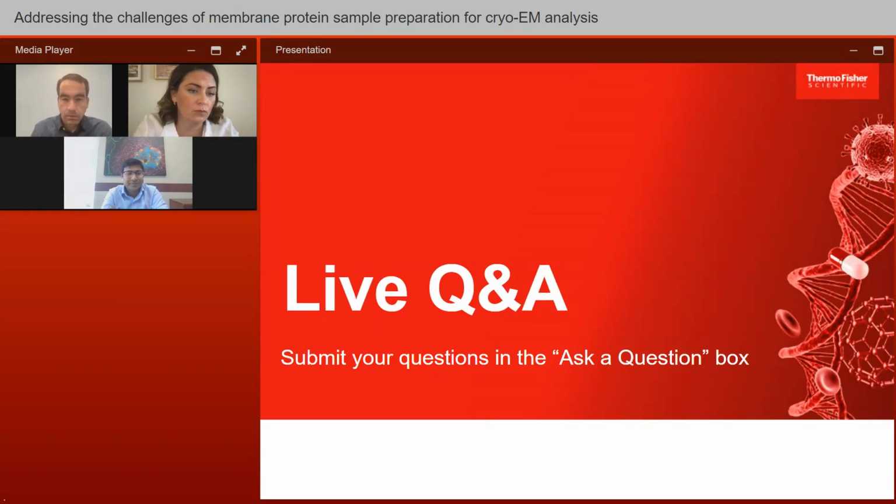Thanks. Great. I think there are about 5 questions in this one. Let me see if we can parse them out here. Maybe I'll ask the first one to Rosie. When reconstituting proteins into nanodiscs, how do you choose the correct lipid composition, and maybe even a step further, the correct lipid ratio for nanodisc reconstitution?